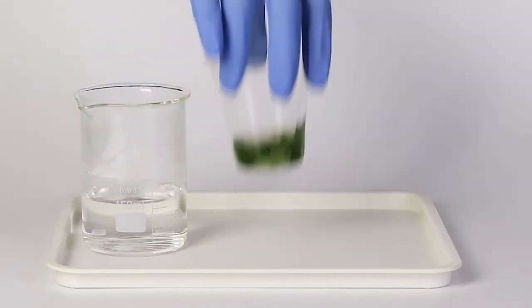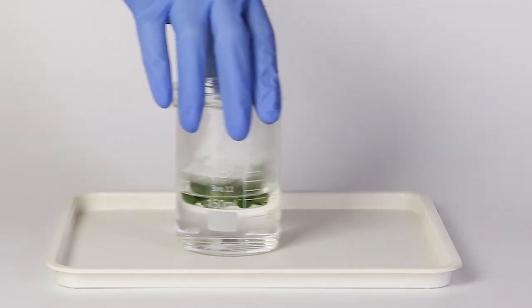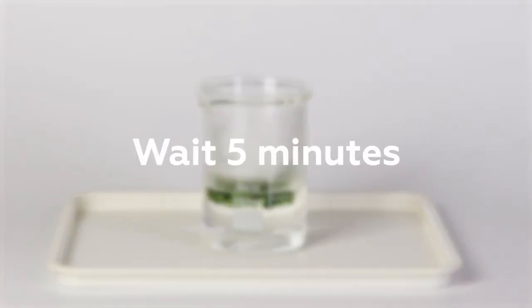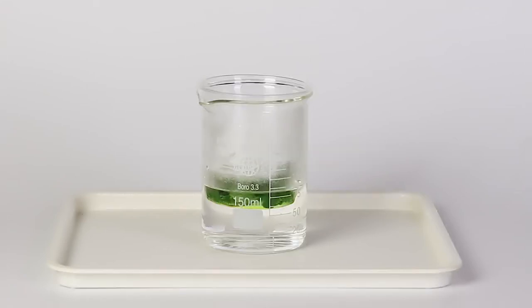Pour some hot water into the beaker. Then put the cup containing the mixture into the beaker. Wait five minutes. While you're waiting, the chlorophyll in the leaves will dissolve in the alcohol.